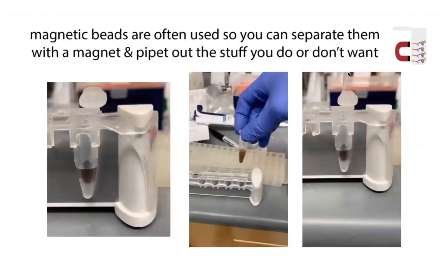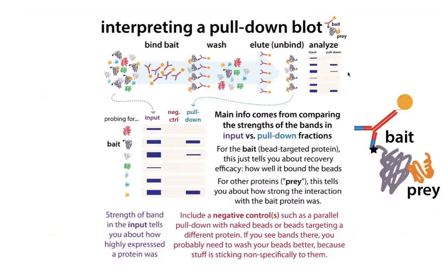So let's talk a little about how we interpret a pull down blot, and then we'll look at some actual examples. Typically, on the left, you'll see an input lane. Basically, this is just showing you what they put in. This is important because if there wasn't any of your bait in the sample, how are you going to see if it's in the pull down?